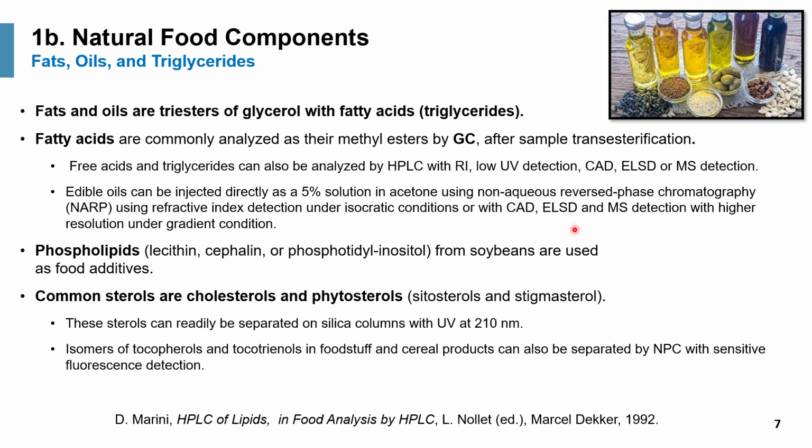However, HPLC often can play a role in certain applications. Edible oil can also be injected directly using a reverse phase called non-aqueous reverse phase, as shown later. Other fat components are phospholipids and common steroids such as cholesterols.